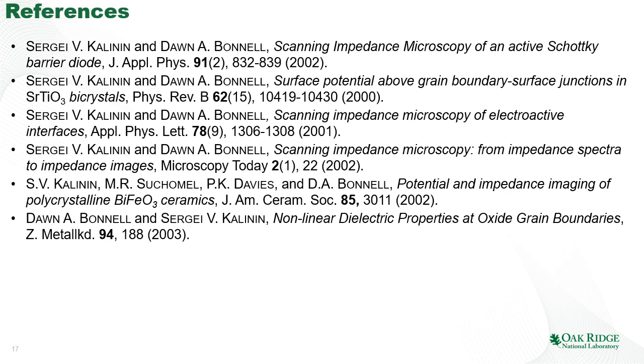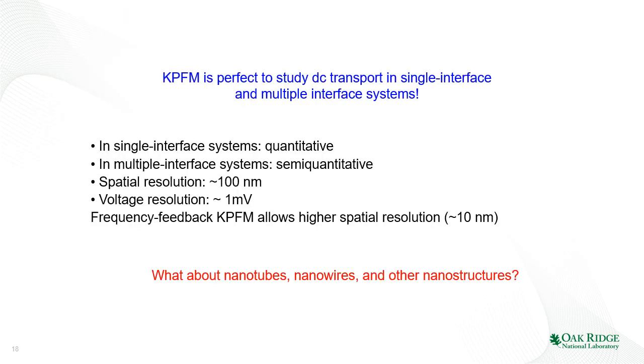in the lateral devices. Now, the summary here is that KPFM is the perfect tool to study the DC transport in single interface and multiple interface systems. So in single interface systems, it would be quantitative. In multiple interface systems, it would be semi-quantitative. The spatial resolution here is about 100 nanometers, plus minus. Of course, you need to take into account the cantilever effects. The voltage resolution is about 1 millivolt. Going to frequency feedback allows much higher spatial resolution, but at the cost of much longer measurement time.